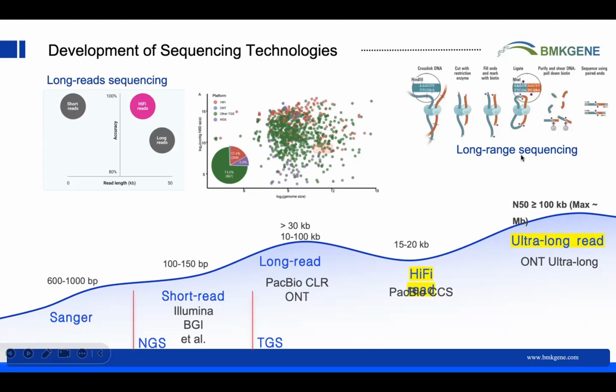So this is the other sequencing technology I mentioned. It's a long-range sequencing technology. We can capture the interaction between two chromosome sites. Then we fix them and cut them using enzymes. Then we can get sequences with half the site and half the interacting site. From sequencing the reads, we can know which parts are connected in the chromosome spatial state.